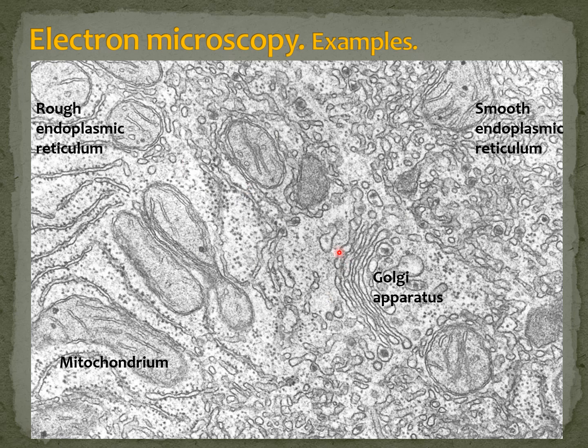So in order to have a high resolution image, like the one we see in here, a photo taken with an electron microscope, to have such a high degree of detail, we have to sacrifice something, and that something usually is we never observe live samples.